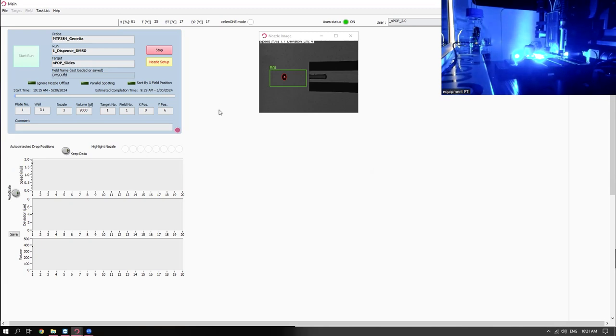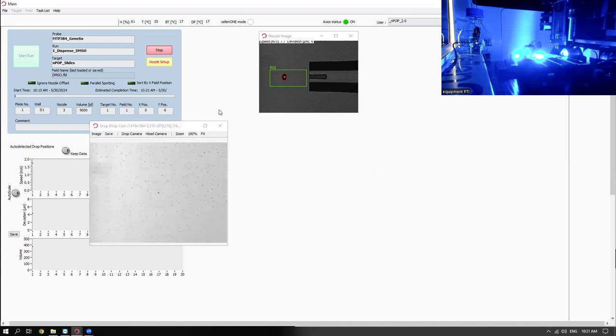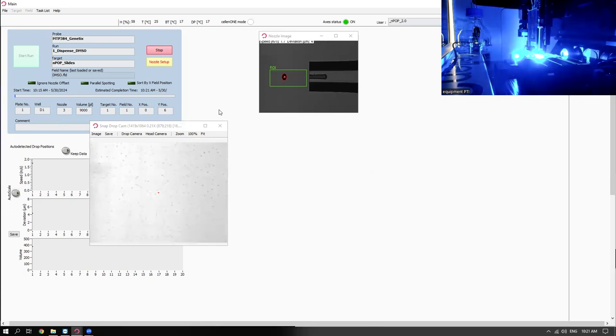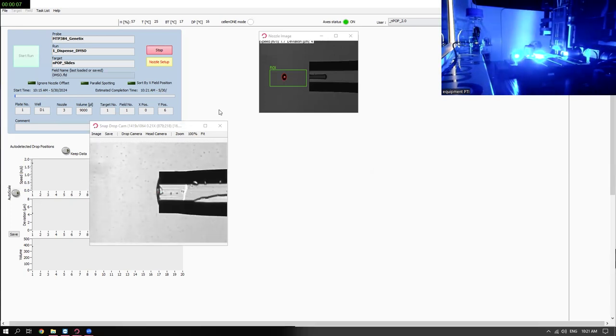No, the cell suspension will be in PBS. We want to clean it up as much as you can to avoid background contamination with proteins and whatnot. But the DMSO is what we dispense onto the surface. It serves two purposes. It essentially permeabilizes the membranes of the cells, starts that lysis process, and it also buffers evaporation and condensation of fluid on the surface.